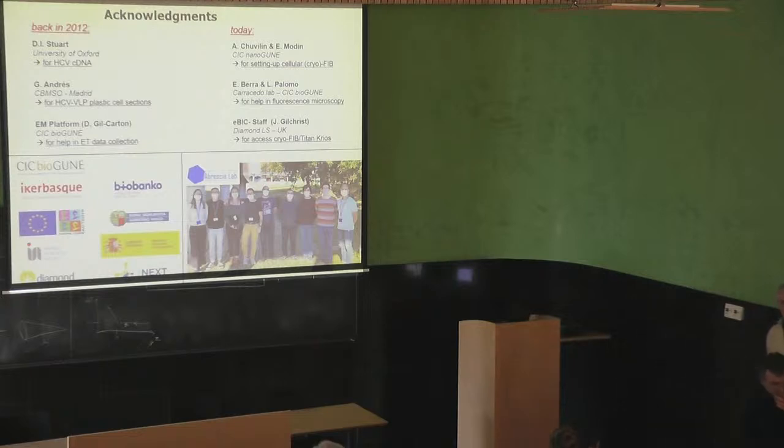You are probably quite concerned about the viral work which is going to appear at nanoGUNE. I would like to say that lab 4, where we will install the microscope, will be rebuilt for biosafety level 2, and the microscope will be inside the biosafety lab. This is similar to what Raoul has on the ground. So now the talks are open to discussion.